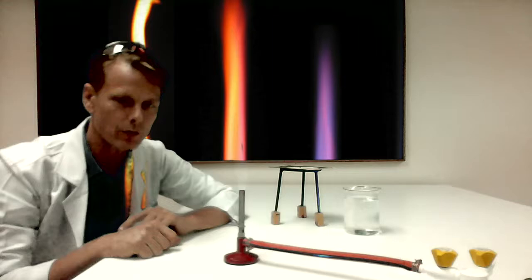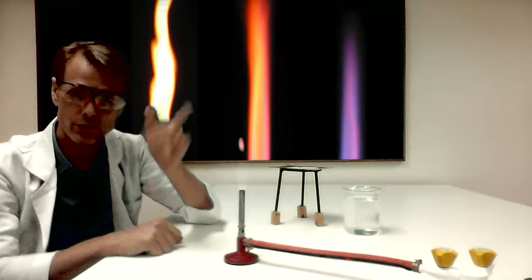By the way, when playing with fire, do not get your hair involved, and you should always use safety glasses.